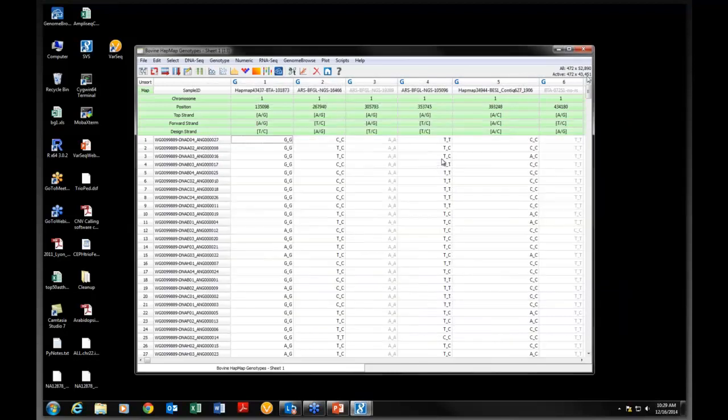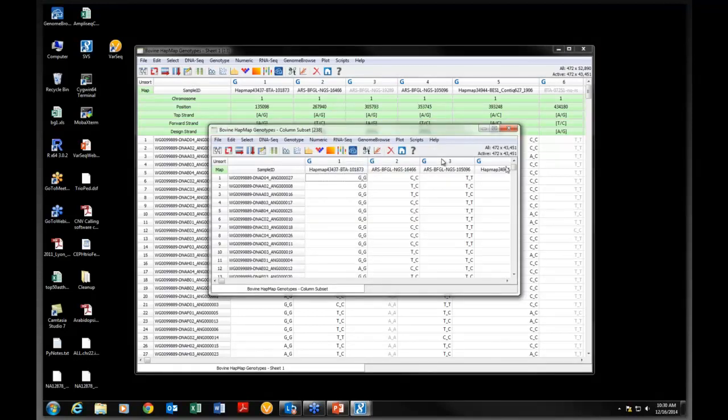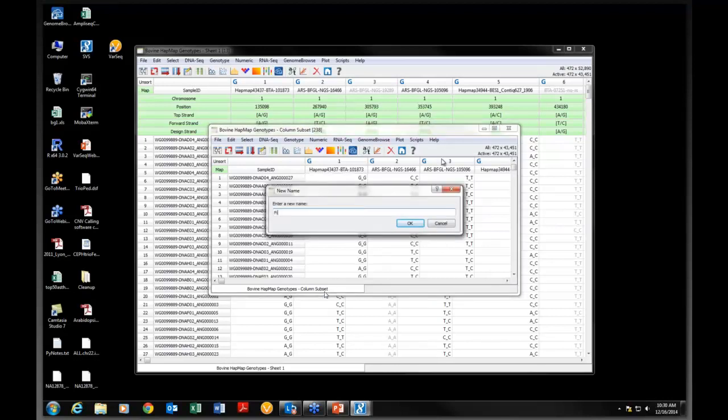Now, in addition, we see that the main data spreadsheet has been reduced to 43,000 active columns. Anything that's gray indicates a failure on the filter, and I can make a data subset. So we mentioned SVS has useful data management characteristics. This is one of them. By clicking a button, I can just get a new subset of those 43,000 active columns, and I'll rename it to call it filtered SNP data.